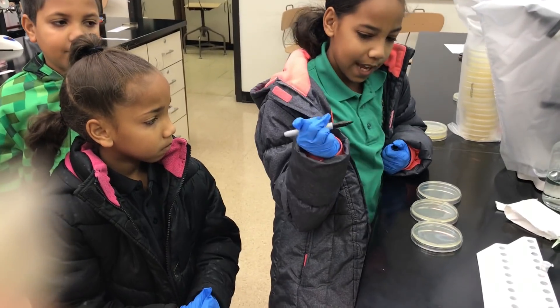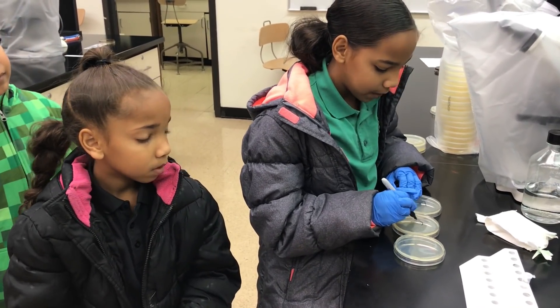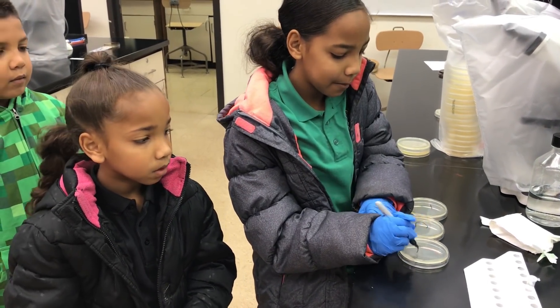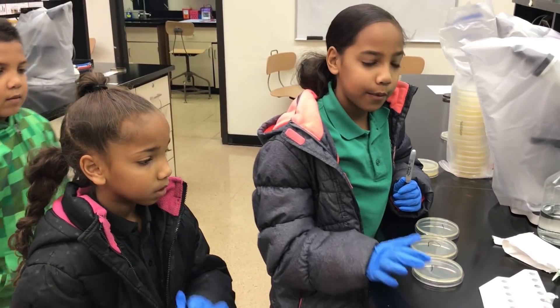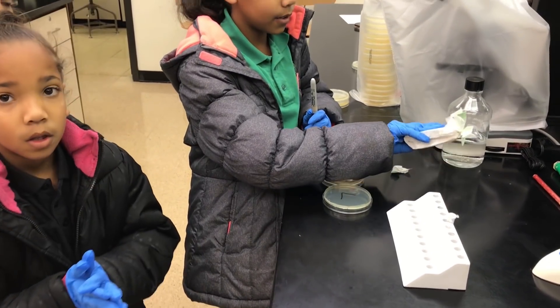We're gonna label T for tablet, C for cell phone, and L for laptop. These are tryptic soy plates with a tube rack and a tube, and some sterile swabs.